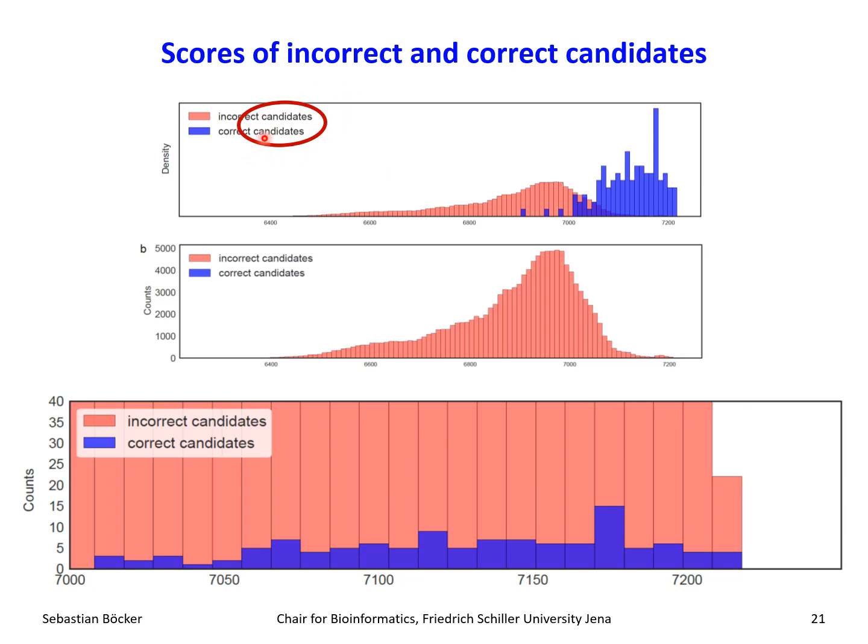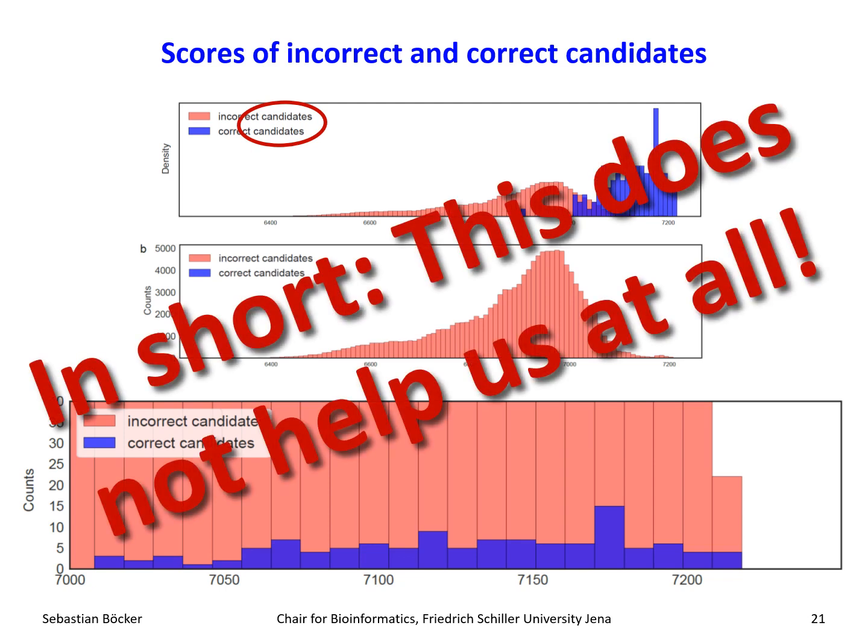And that's because we are looking at candidates and not at hits. Okay? So all of that, to make it short, it doesn't help us at all. Obviously, a method that has a good search capacity that can actually find and annotate a reasonable number of correct structures will have such a plot, but that doesn't mean anything for differentiating between correct hits and incorrect hits. Okay?